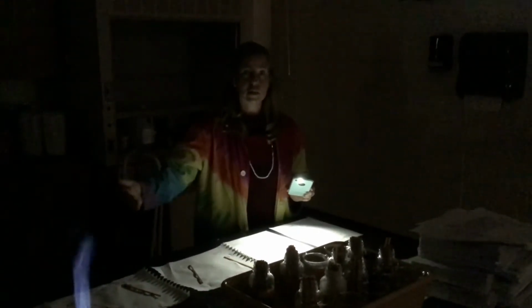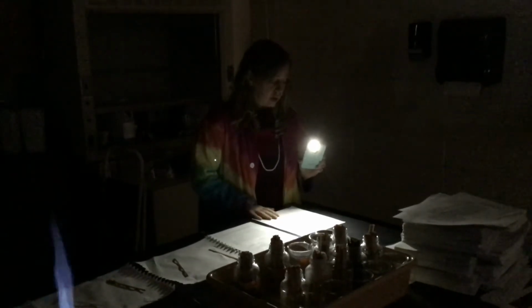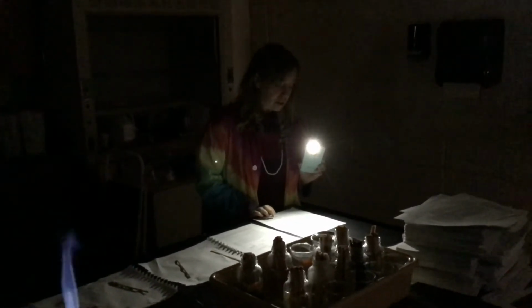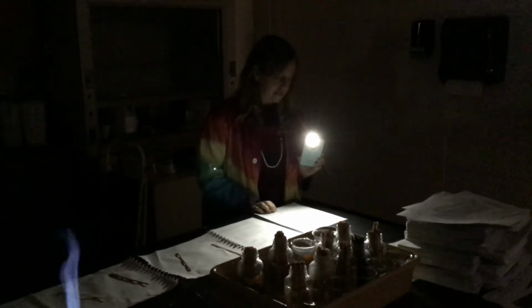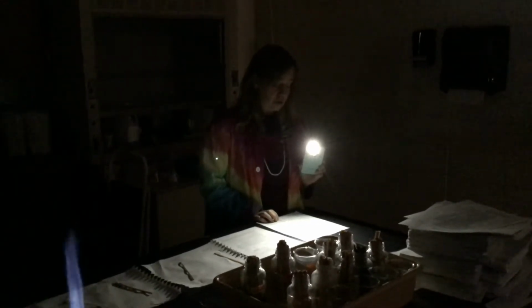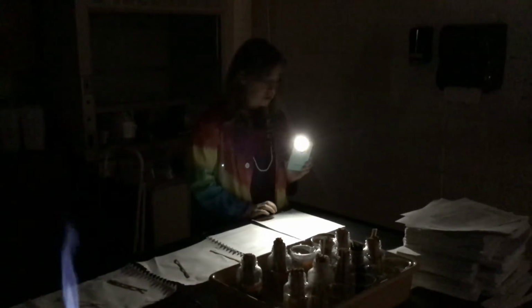of the known samples. So according to our current theory about the structure of atoms, and this is the handout that you were given, okay, the structure of atoms, electrons are found around the nucleus in regions called orbitals. Orbitals represent the potential position of an electron at any given point in time. They are located at different distances from the nucleus and have different energy levels associated with them. Each orbital, however, can only hold 2 electrons. The electrons of an atom fill low energy orbitals, which are the ones closest to the nucleus, before they fill the higher energy ones. Electrons are in a ground state when under stable conditions.